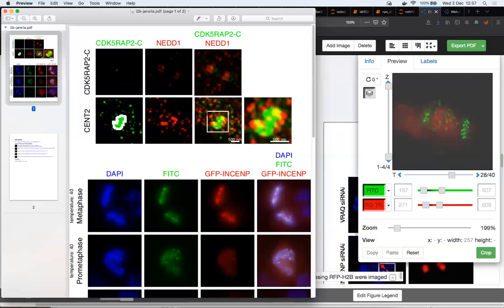And I can, let's say, choose the font Calibri instead of Times New Roman, which is not something which OMERO figure will do for me. Nevertheless, of course, once in Adobe Illustrator, I lose this nice connection between OMERO figure and OMERO. But nevertheless, this would be a nice follow-up on the workflow I showed you.